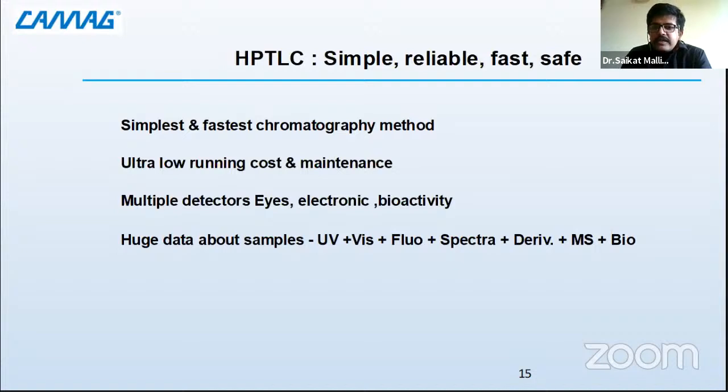So you see that people will say, "Neem is very good. It has antimicrobial activity." But how do you see whether it is antimicrobial? That is possible with this. You apply the neem sample onto a stationary phase, develop it with a mobile phase, and then you subject it to microbial activity. You expose the plate to a culture of microbes. And if the microbe is dying, showing a zone of inhibition, not growing, that means it has got antimicrobial activity.